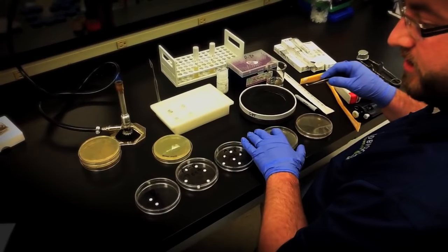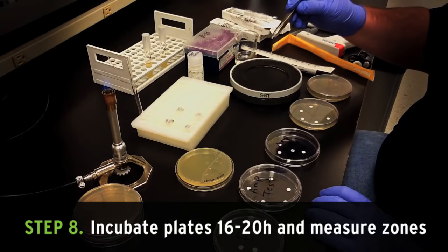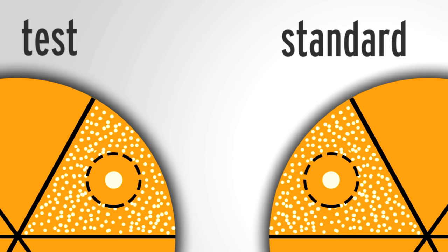After all the discs are placed, incubate the plates inverted overnight, and then after around 16 to 20 hours, measure the zones of inhibition around each disc. If the test discs match or exceed the standard, then your product is working correctly and you'll be able to use them for other experiments.